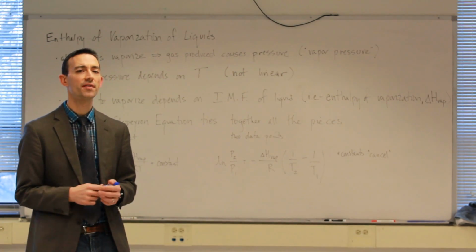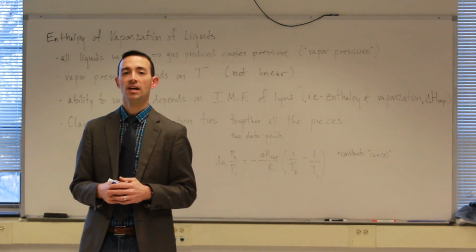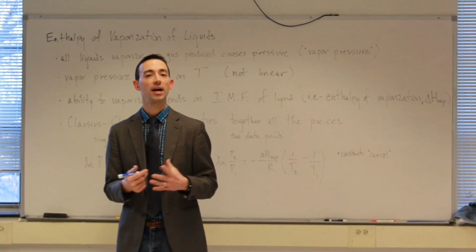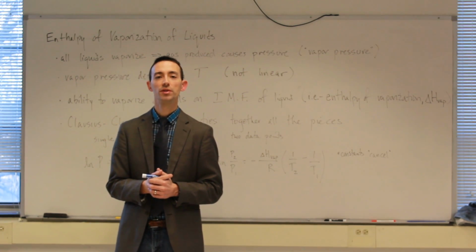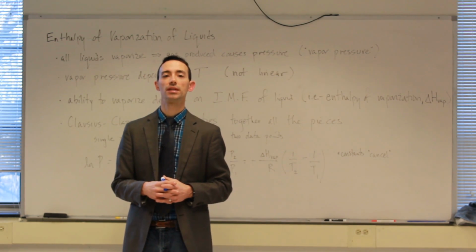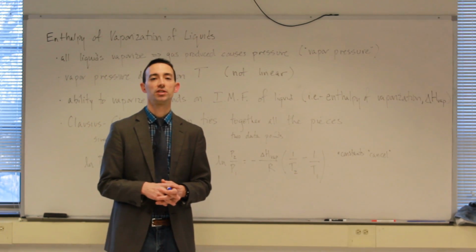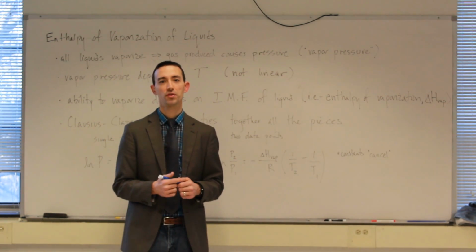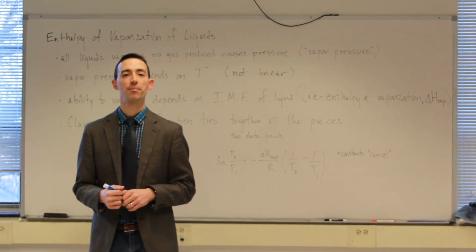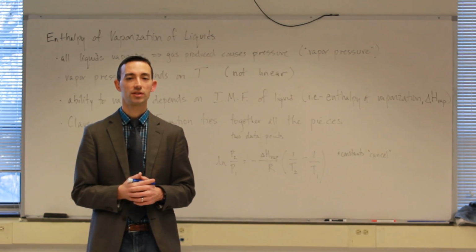So let's review some of the concepts that are at work as part of this exercise, and I'll run you through the bare bones of the types of calculations that we're going to help you do this week. We'll be doing a lot of work in Excel spreadsheets in lab, very much like what we did for density calculations back in our Chemistry 1 curriculum if you took General Chemistry 1 here at York. All right, and I'll wrap up by briefly addressing a few of the points in the PreLab questions as well.